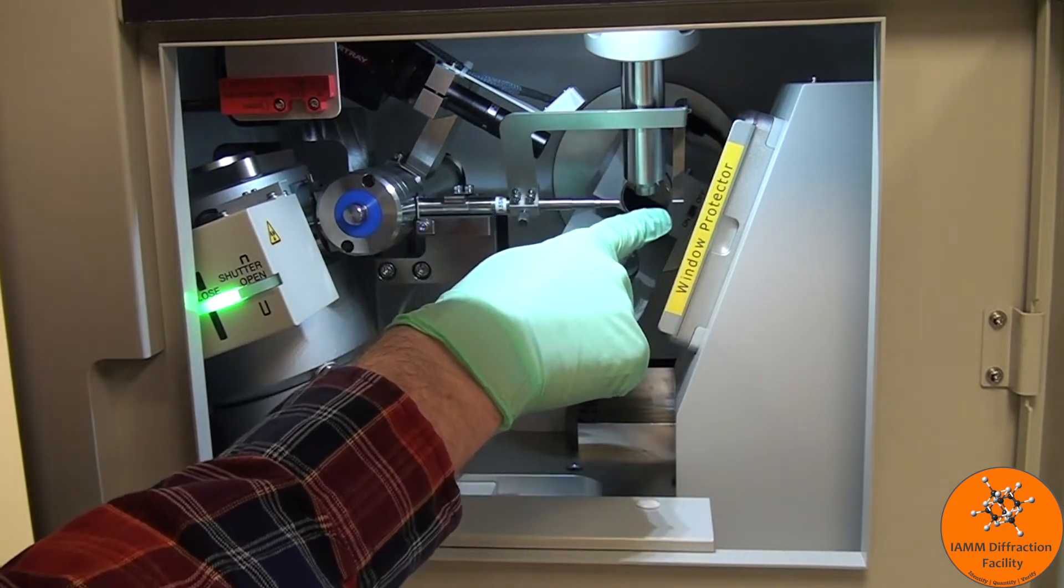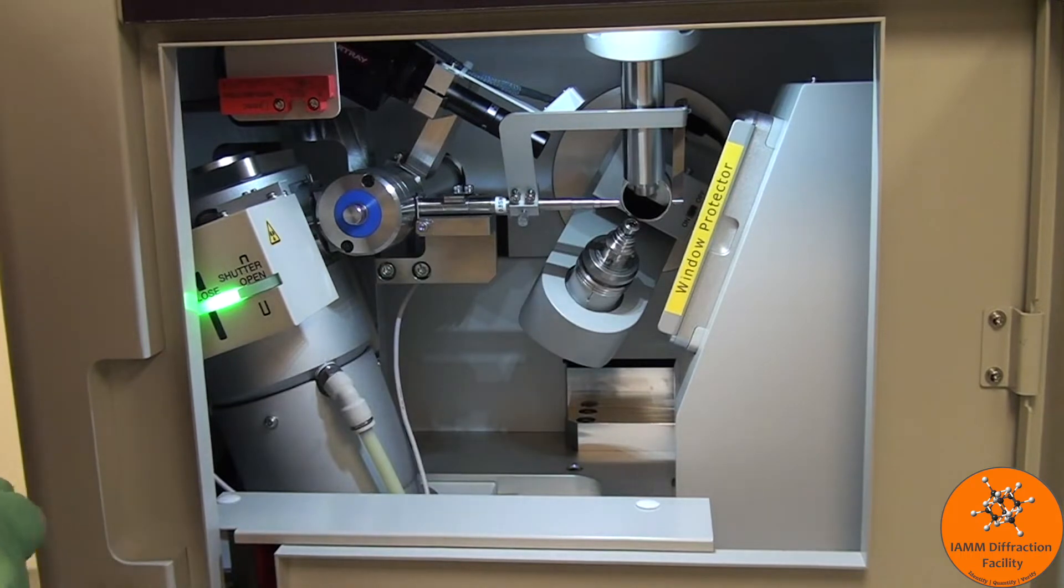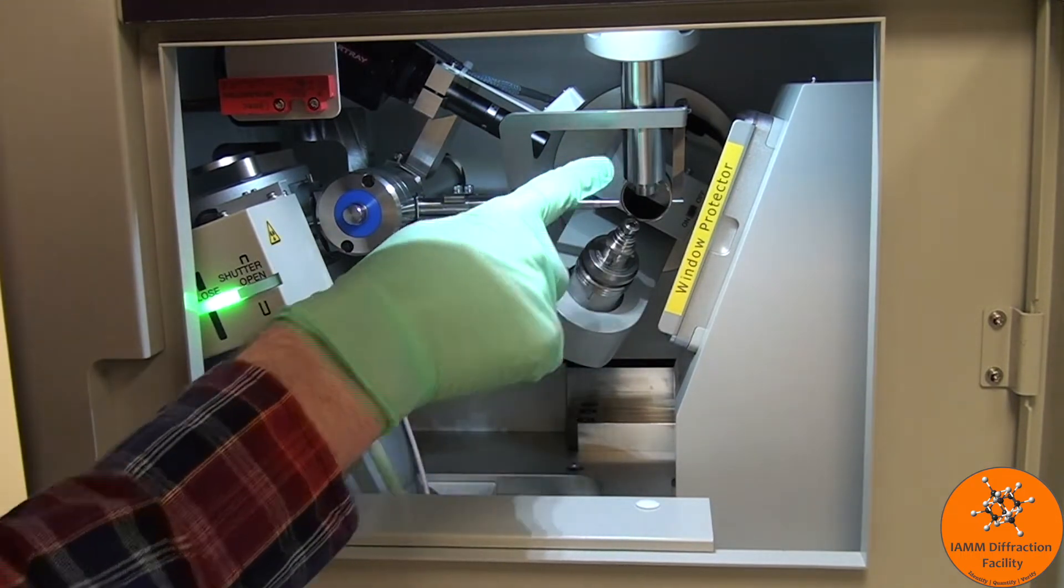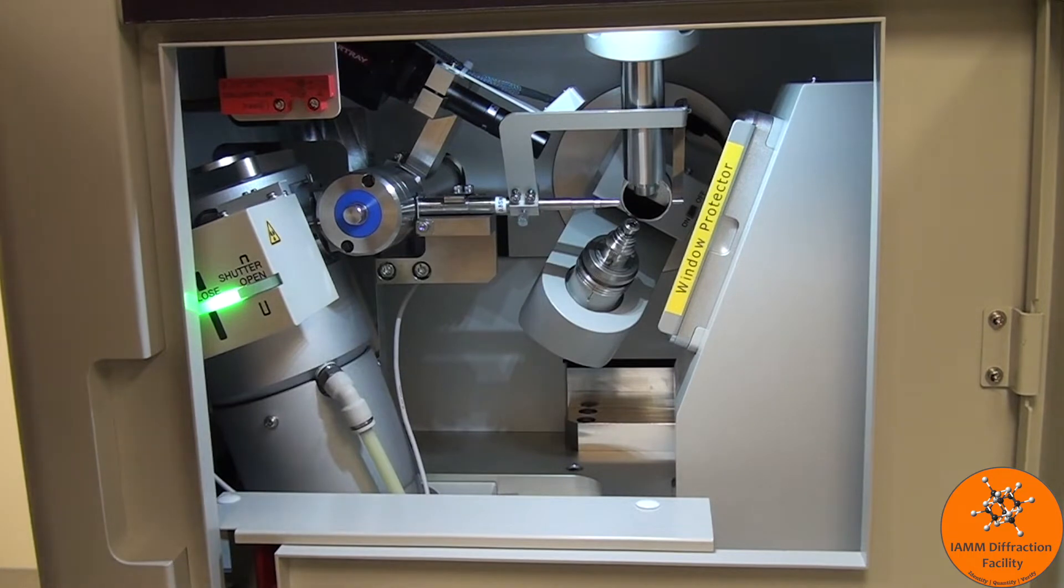This right here goes to the beam stop so that we don't shoot the x-rays directly into the detector. This right here is the nozzle for the nitrogen gas that allows us to cool our system down to 100 Kelvin.